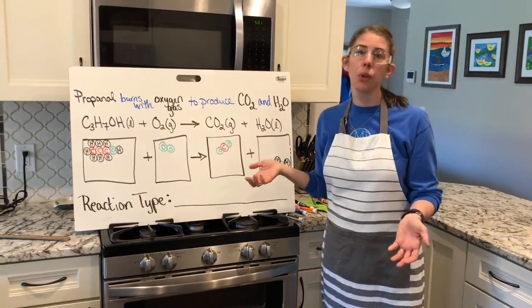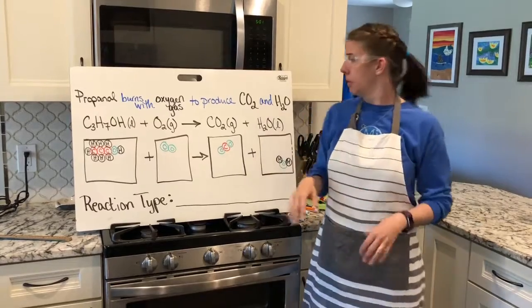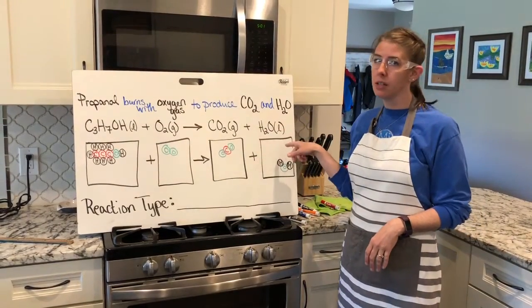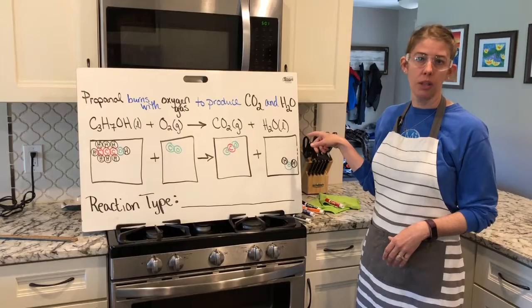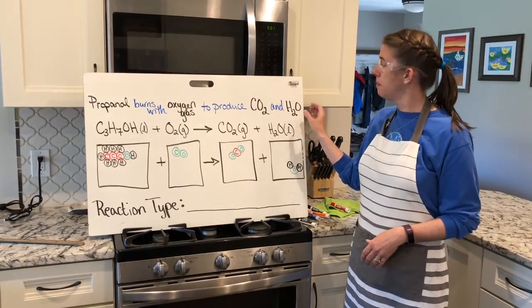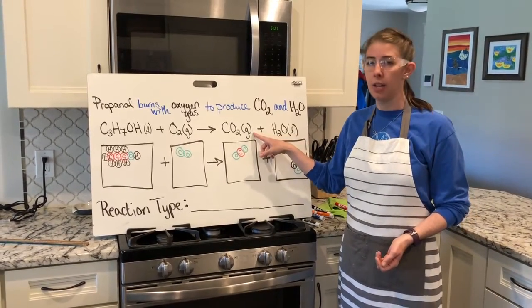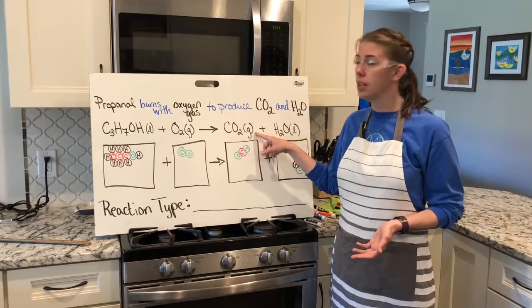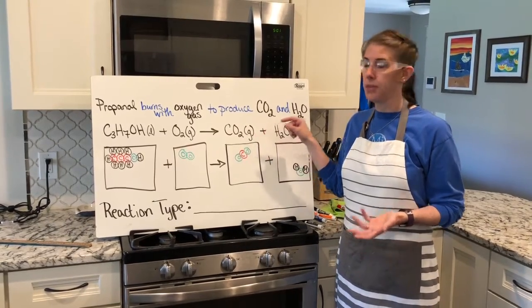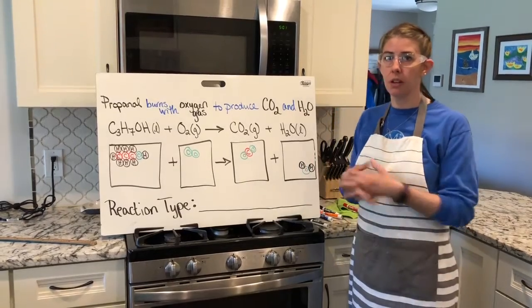If we were in class, I'd have a student say to me, let's do it again. And if you look at our products, what's the liquid? The liquid's water. That's not flammable. The gas that was generated inside is carbon dioxide. That's one of the ingredients in a fire extinguisher. So unless we do some things differently, repeating this right away is not something you're going to be able to do.